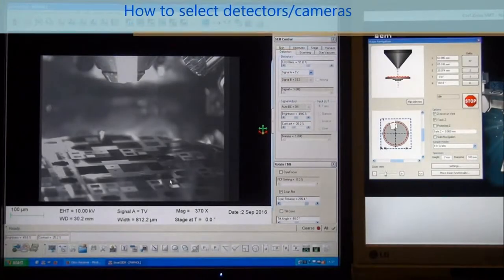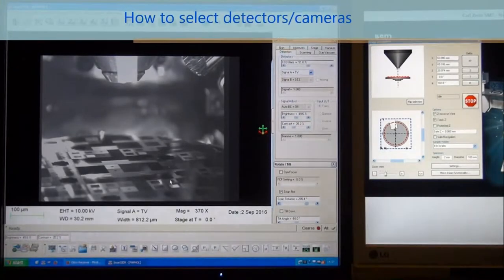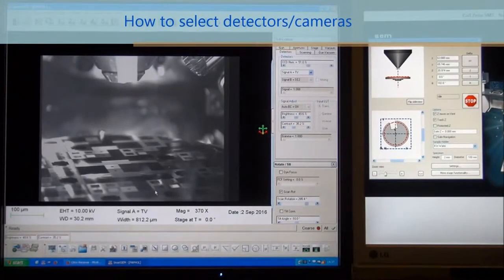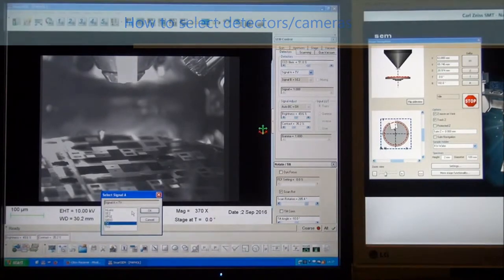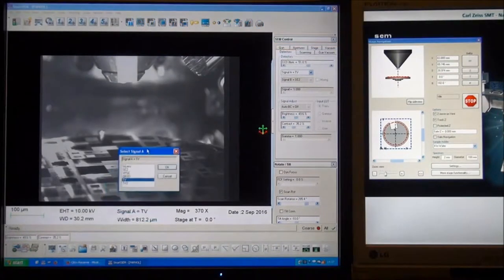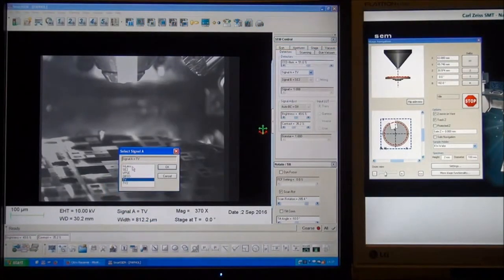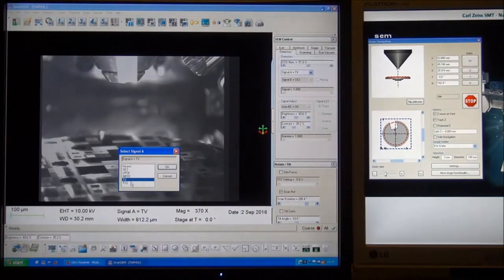On this SEM there are two cameras and four detectors. You can choose them by double-clicking on signal A, and then you can see the four detectors and the two cameras.